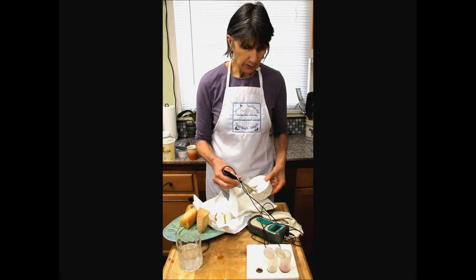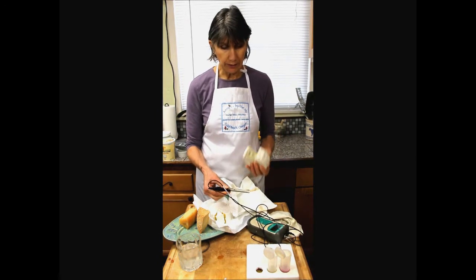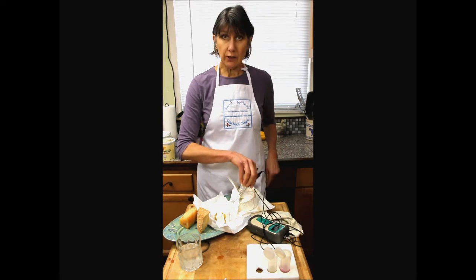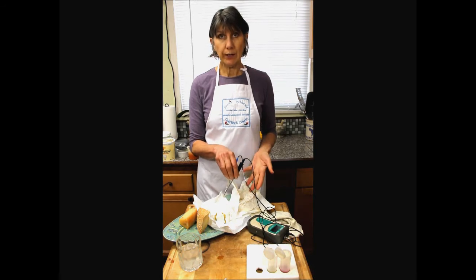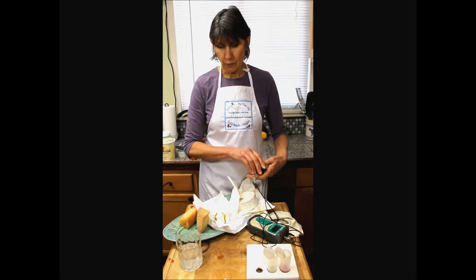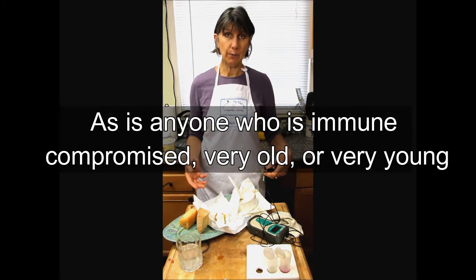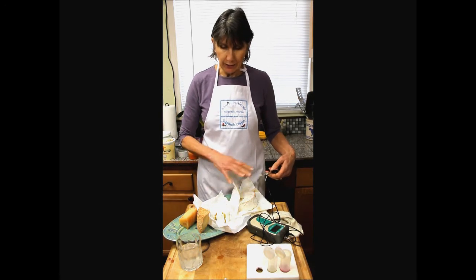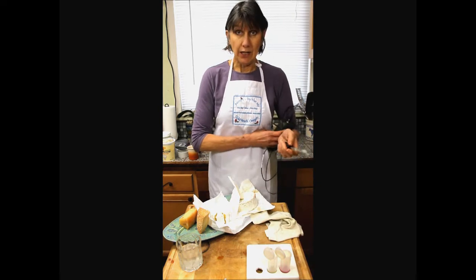7.7, moving up closer to 8. Is exactly what we'd expect. And again, an overripe cheese. These cheeses with their high pHs are considered the most risky, if you will, especially for pregnant women, who are at more risk because they're under stress of not being able to process the same number of dangerous microbes that the rest of us can process daily. So handling them is something important to know because the pH is key.